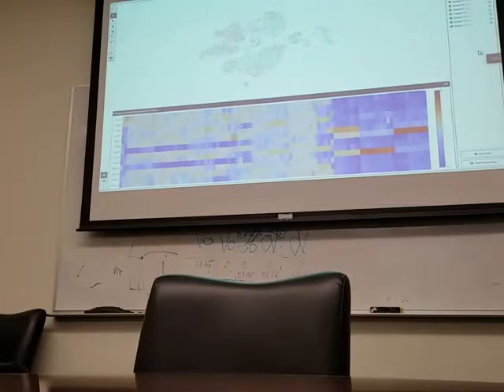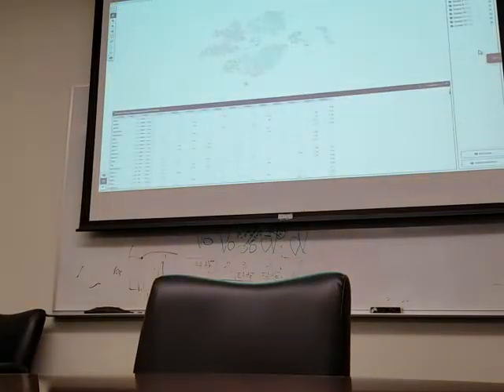Those 3 little icons. Yeah, right, that one. That's table view. Yeah. And then you can export with the arrow in the upper right. Okay, and then it puts the genes. Right. And then you can put it in whatever heat map program, or we can do that. That would be good. And you can do the top 50, 100, or 1,000. So that would be something to do. But you can also annotate the clusters based on the person. Yeah, that would be good too. All right, so what about the B cell receptor?